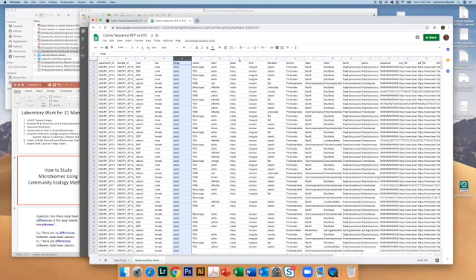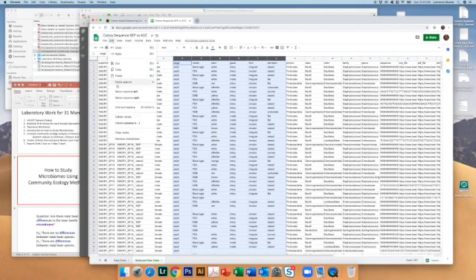We're not really interested in the type of agar plate that the colony came from or the phenotypic characteristics of the particular bacterium. I would go ahead and get that information out. So highlight those columns and go to edit and say delete the columns. Delete columns, in this case E through J.